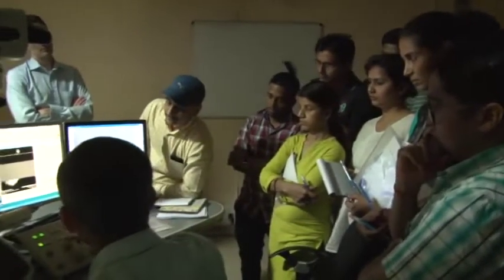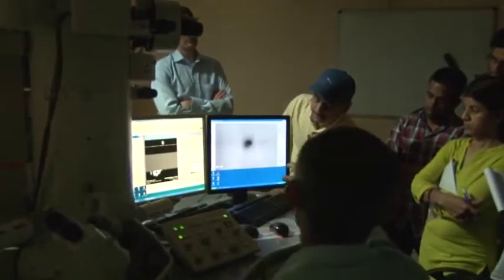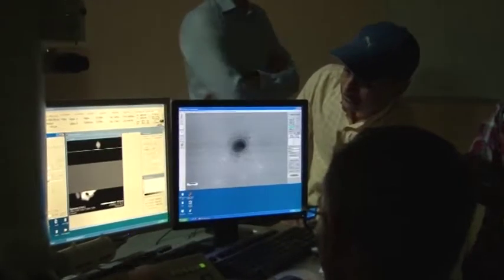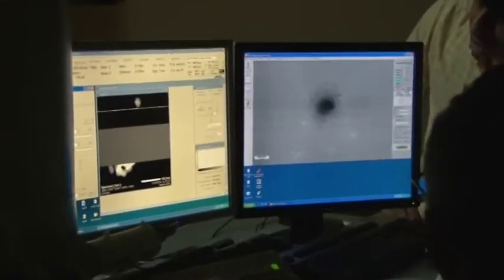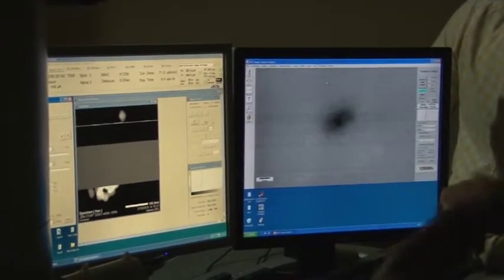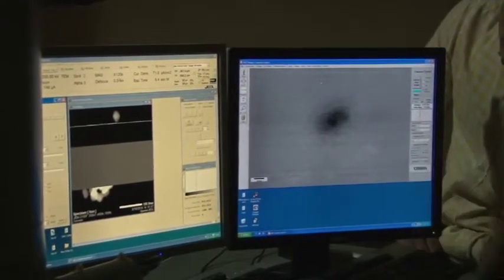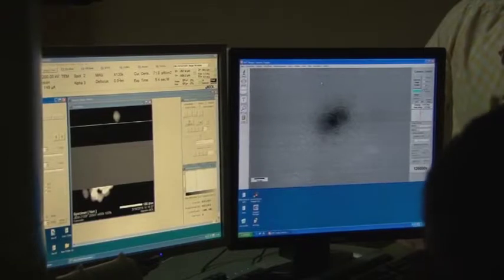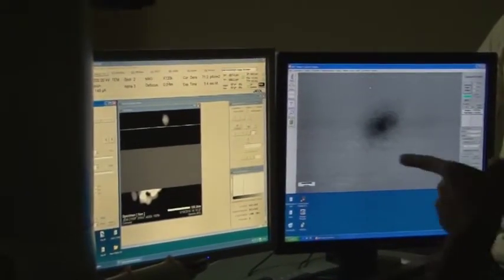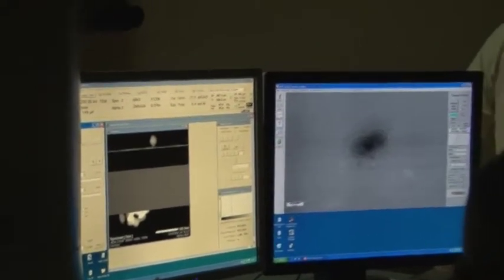So for that maybe we will slightly, no, it's alright. Let's see how it works. Our Z height shouldn't be so off also. So I am making this image wobble, and so see, it's moving, but our camera system is probably slow to react, or the acquisition time must have been so large that it is not able to follow the wobbling.